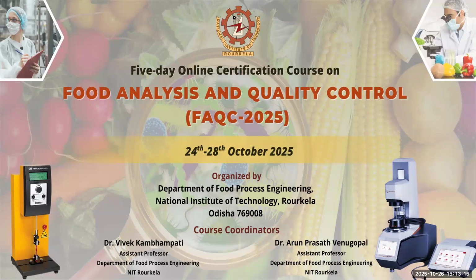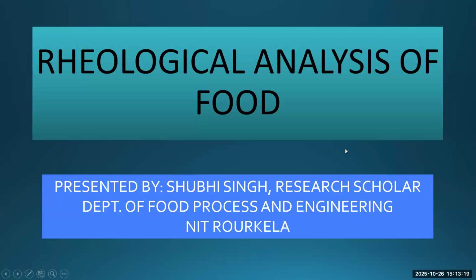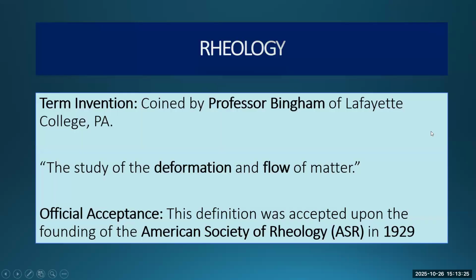Okay, so we will be starting the next session, rheology, rheological analysis of food. The term rheology was coined by Professor Bingham of Lafayette College. It is basically the study of the deformation and flow of matter.